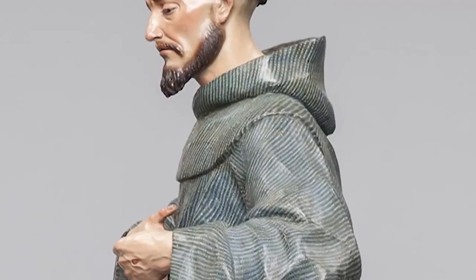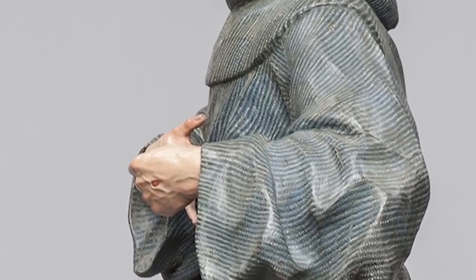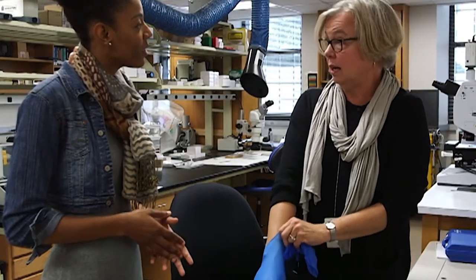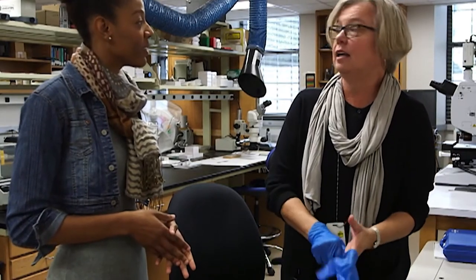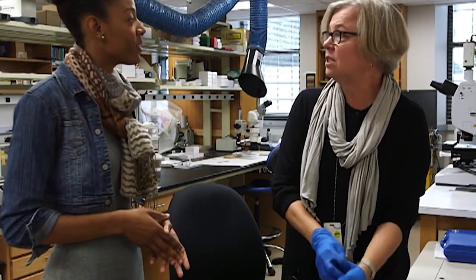If we go back into the XRF room and pull St. Francis away, have another look at the knuckle and you will see that it's pink. What did you ultimately learn from all the research you did on St. Francis? What we learned is that the painted surface you see on St. Francis right now is not the original surface — it was applied sometime around the late 18th century or later.